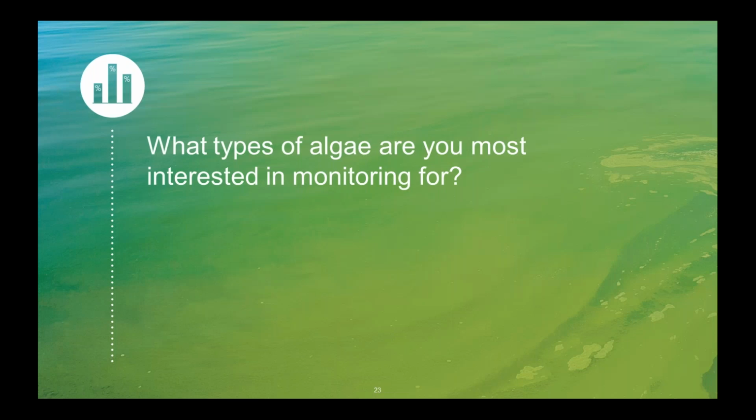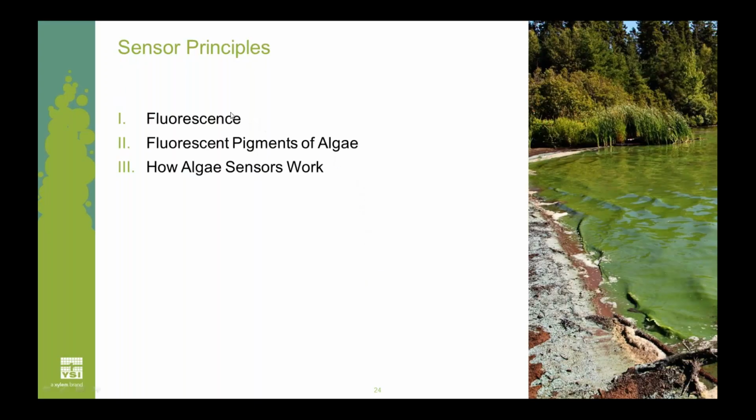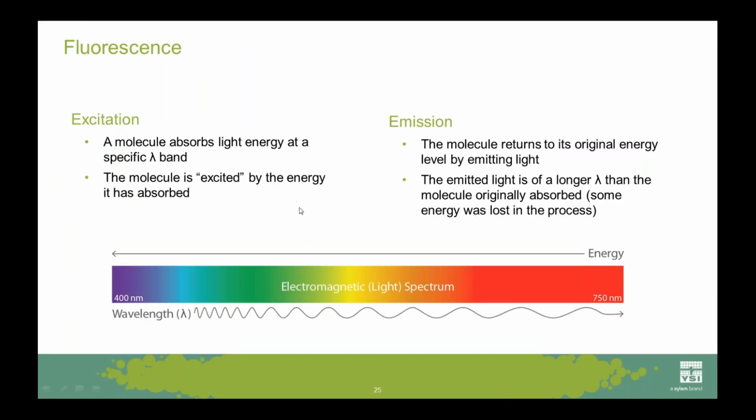Because there's a lot of material for us to cover. So much so that I usually divide this section into three subsections, if you will. I want to remind people about some of the fundamental principles of fluorescence. And one of the reasons I do this is because we often forget these things, and this really drives your understanding of what the sensor is going to do for you. And you need to understand that before you make conclusions from using the sensors.